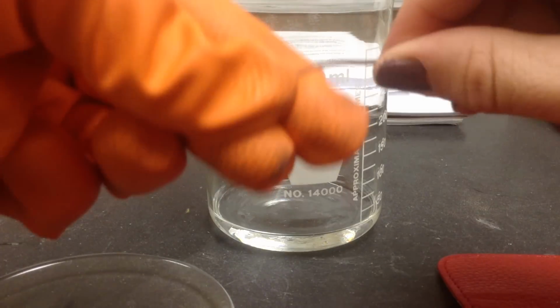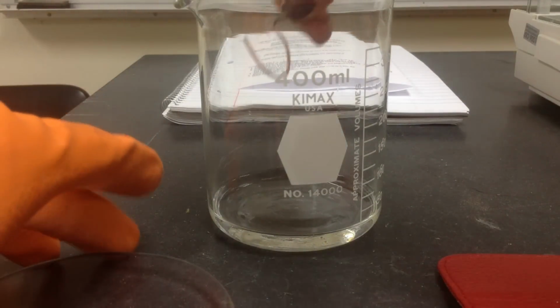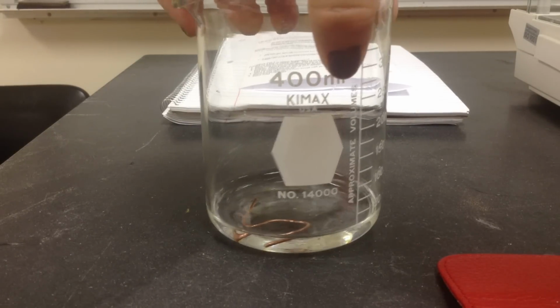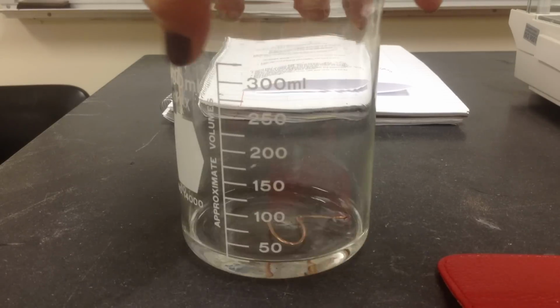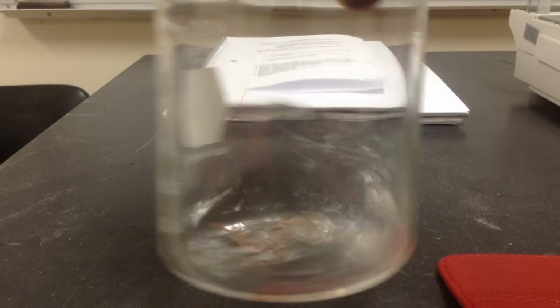I'll even twist it a little bit so that it's just curled up a little. All right. We will leave that overnight, and we'll see if we can get some good corrosion.